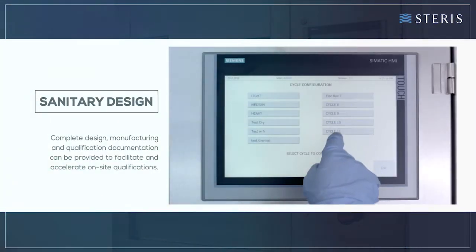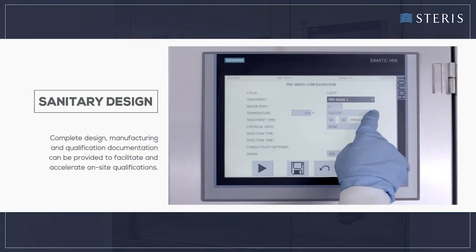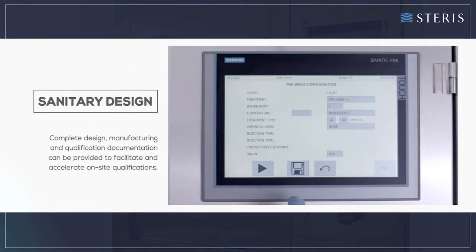Complete design, manufacturing, and qualification documentation can be provided to facilitate and accelerate on-site qualifications.